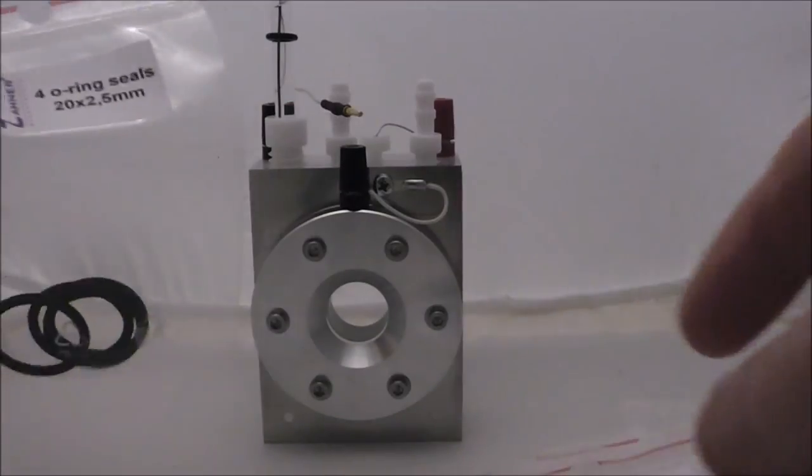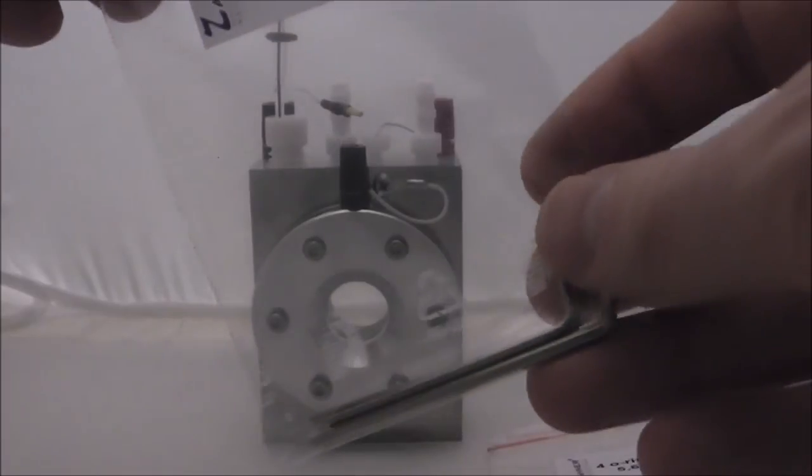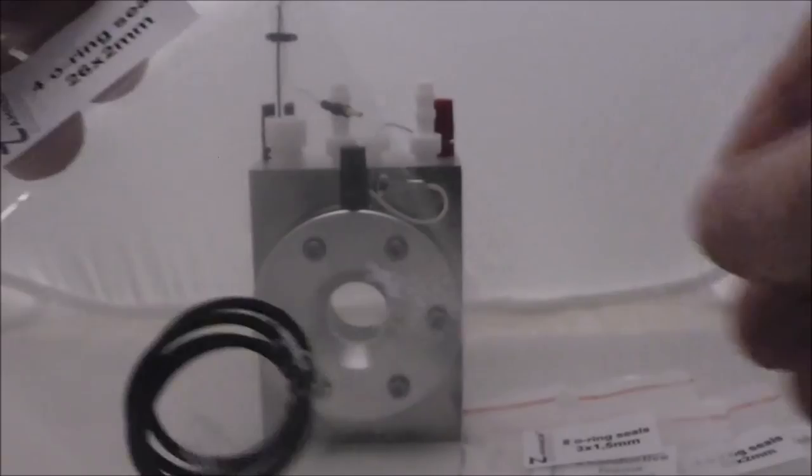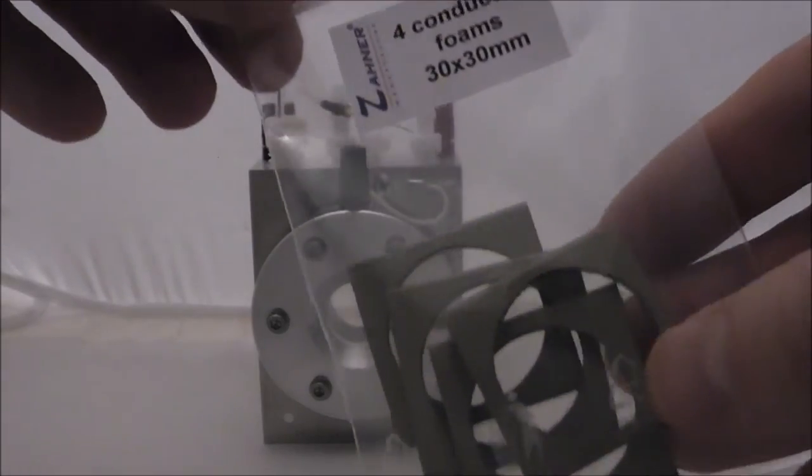They include extra seals, any hex keys or Allen keys that you would require. It's not just one of each seal sent, they send a whole series. Conductive foam is used in the cell as well.